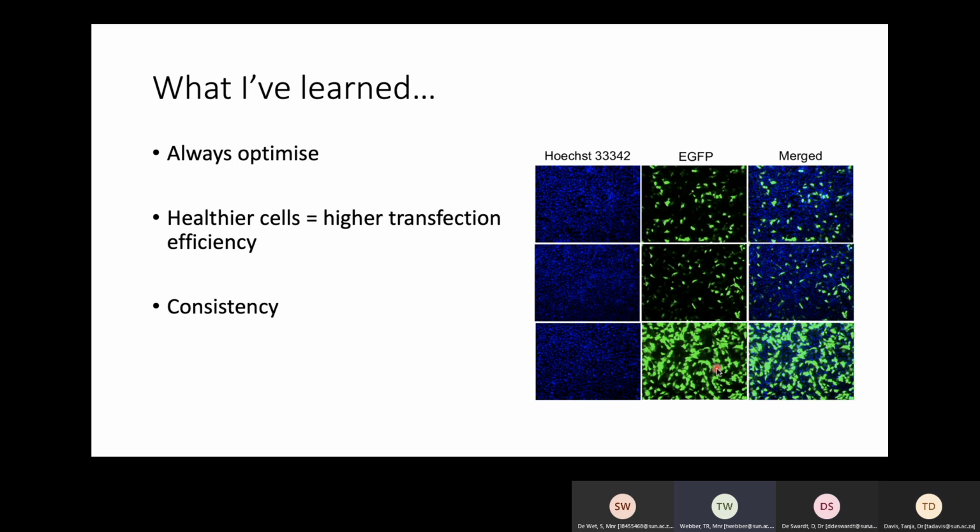So in our department, they have a nucleofector, which uses electroporation. What they've told me is that there's a lot of cell death that results from the electroporation. And also, for some reason, even with help, they couldn't get good enough efficiency with it.